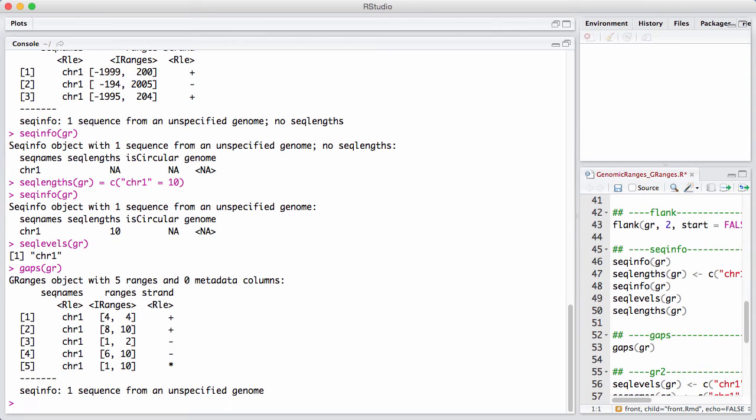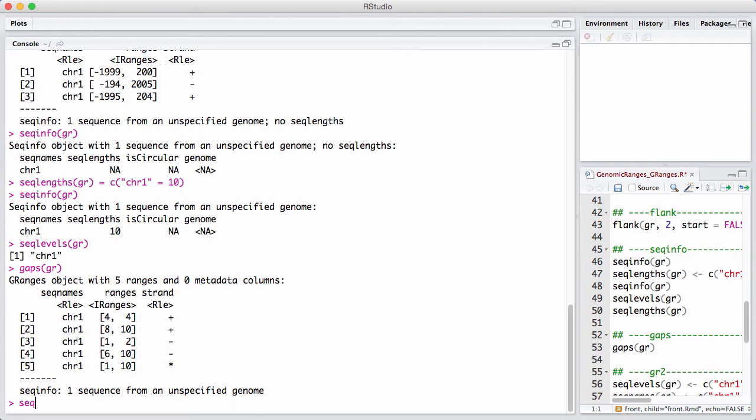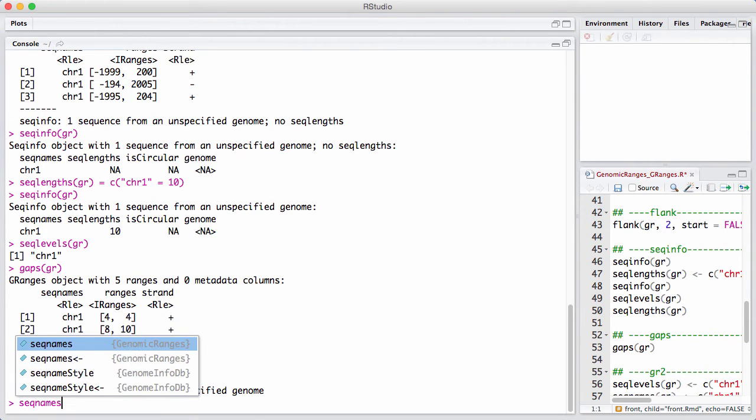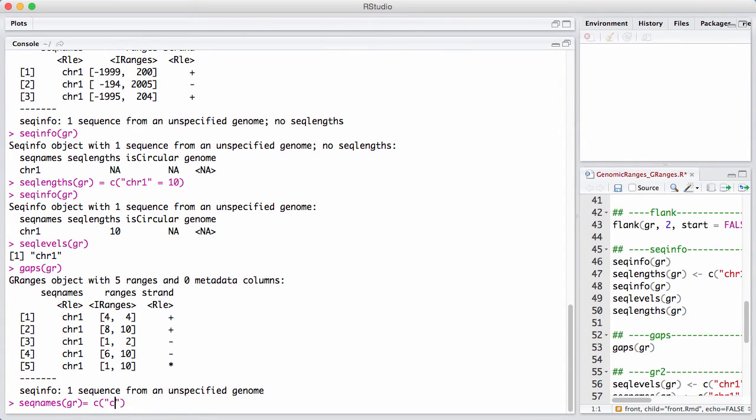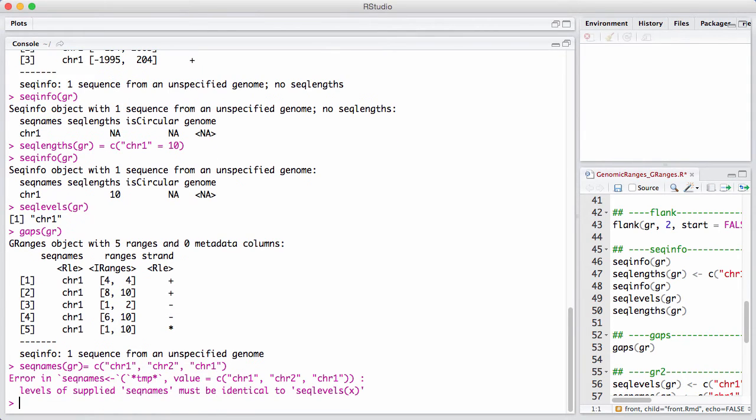Let's try to expand this with a new chromosome. It seems straightforward that you should be able to do something like seqnames of GR to be equal to chromosome 1, chromosome 2, chromosome 1. But we get an error. And the reason we get an error is that it has recorded that there's a single chromosome in this hypothetical organism.